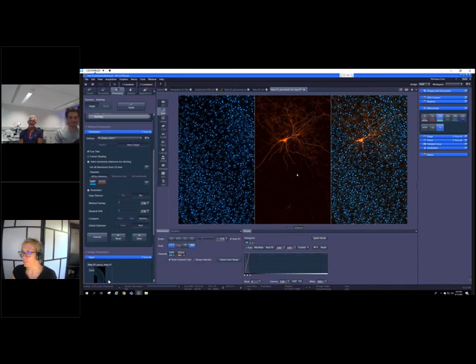I was especially impressed with the well plate example. Setting up a quick screening of the wells followed by calculating transfection efficiency and then displaying it as a heat map. I think you did that all in under 5 minutes. This is really powerful, and it's so cool that this can be done in both wide field and confocal systems on the inverted platform.